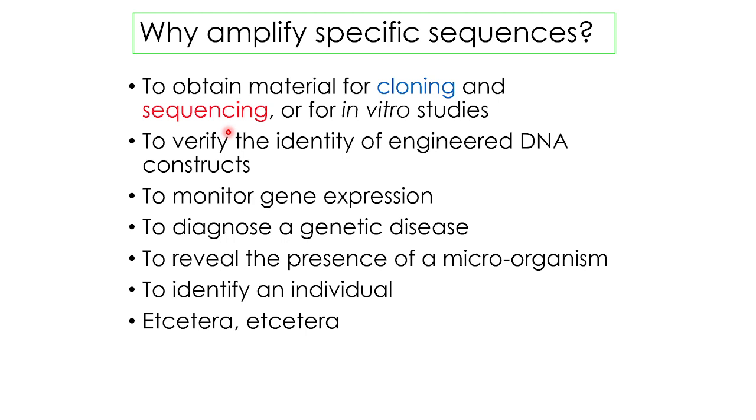So why amplify specific sequences? Why is it important? One is to obtain the material for cloning and sequencing, say for in vitro studies. It also helps us to monitor gene expression and diagnose different kinds of genetic diseases. It also helps us to verify and identify different engineered DNA constructs.